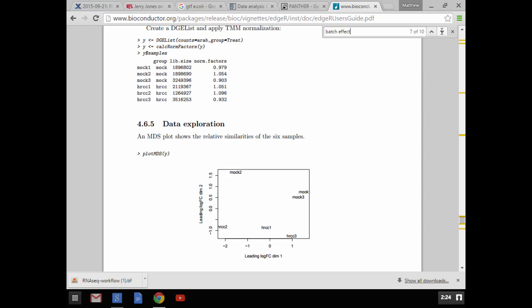So if I'm sampling from lung and salivary glands of an individual and comparing it across the board, what I want is to see what genes are differentially expressed in the saliva versus what are differentially expressed in the lung, right? But if the differences between the individuals link much more closely than the sample type, I'm never going to see that. It's going to give me huge amounts of dispersion. Does that make sense? Is everybody with me?